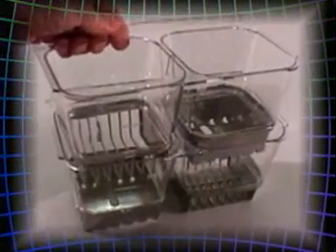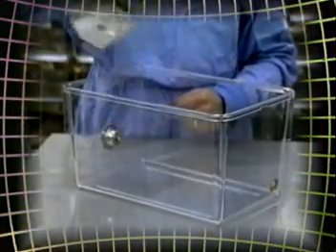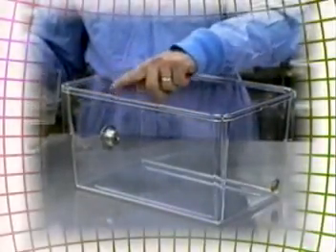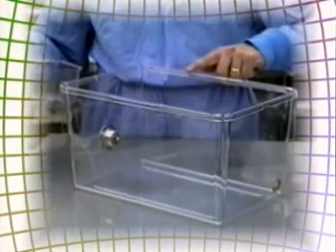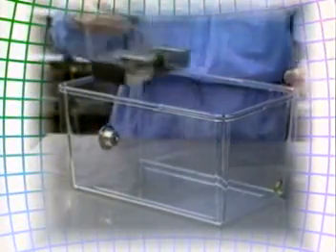The modular diet delivery system stacks for storage and features a front flange for easy handling. A recess in the cage lift secures the feeder in place and allows the feeder to be positioned at either end of the cage.